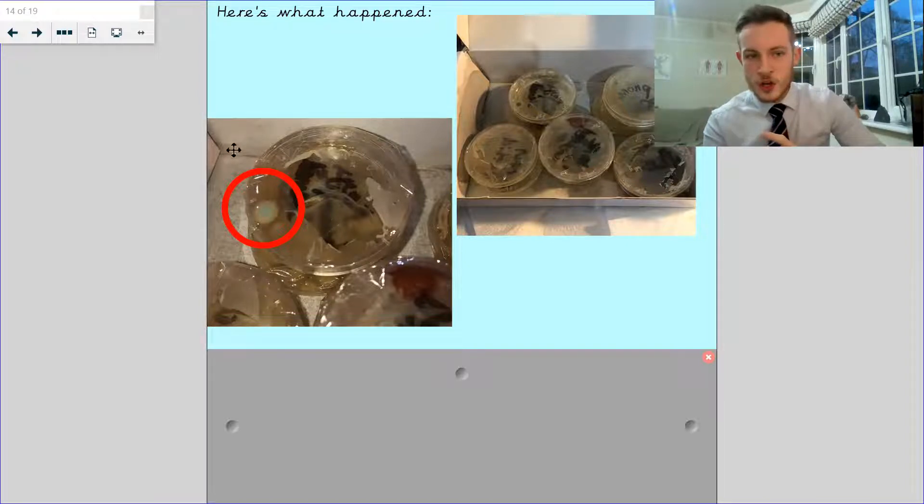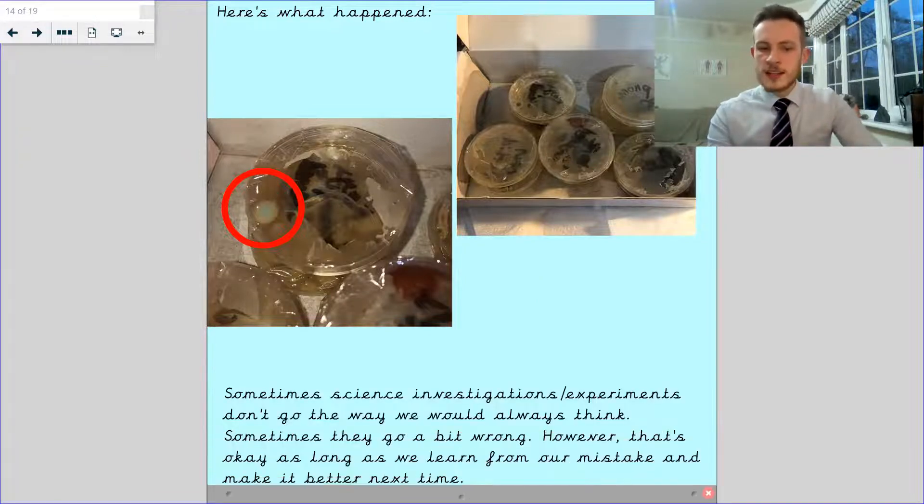As you can see here in this red circle, that is the start of a growth of bacteria. You can see the bacteria or the mould was starting to grow. So the experiment failed and went wrong, but actually there were some bits of it that were right. We knew the jelly was right and the swabs were good because we can see the bacteria starting to grow. The one thing that went wrong was it was too hot. Sometimes science investigations or experiments don't go the way we always think — sometimes they go a bit wrong. However, that's absolutely okay, as long as we learn from our mistakes and make it better next time.